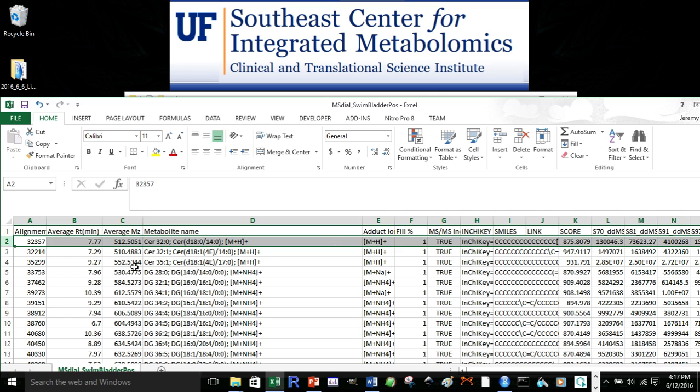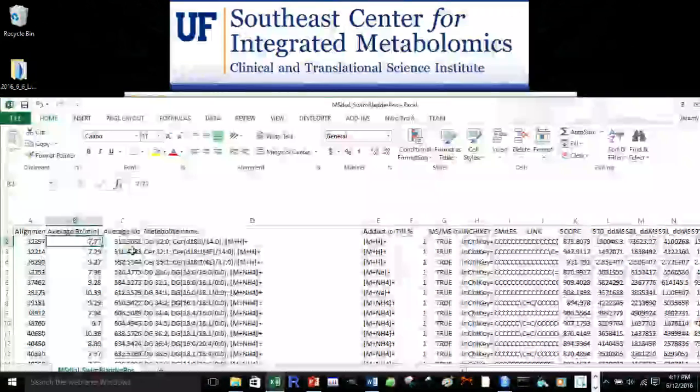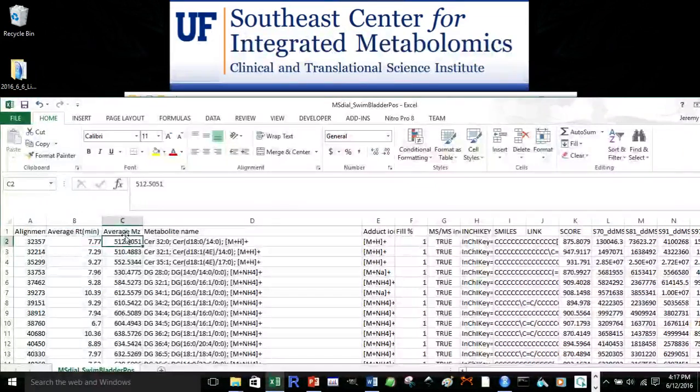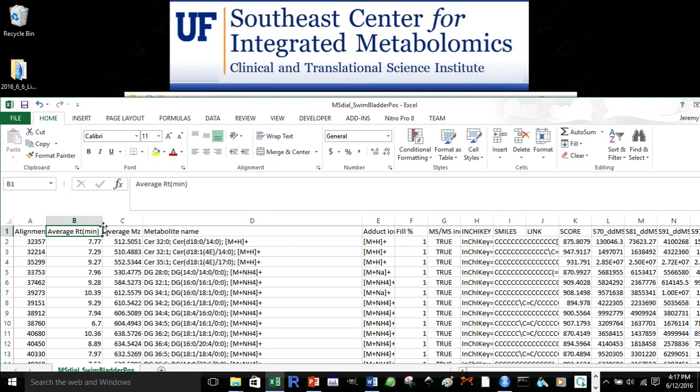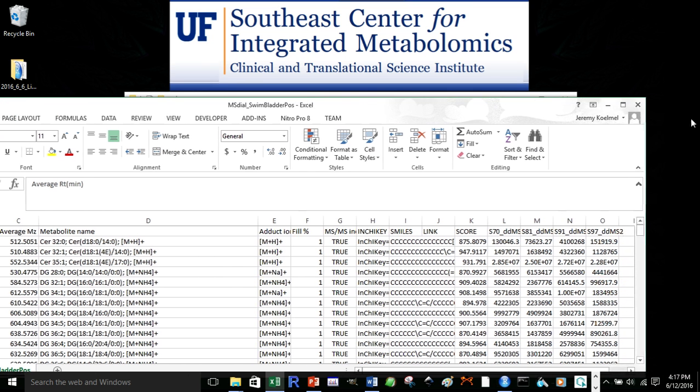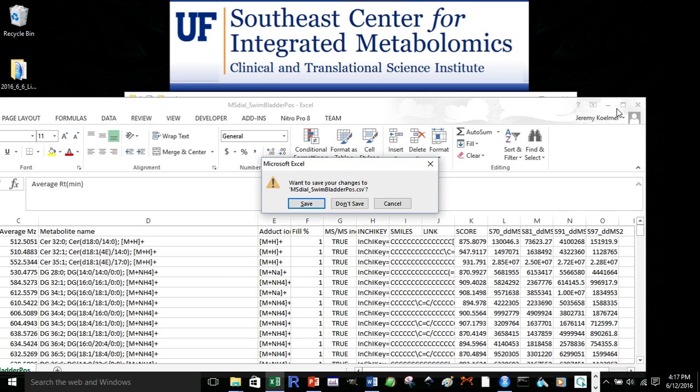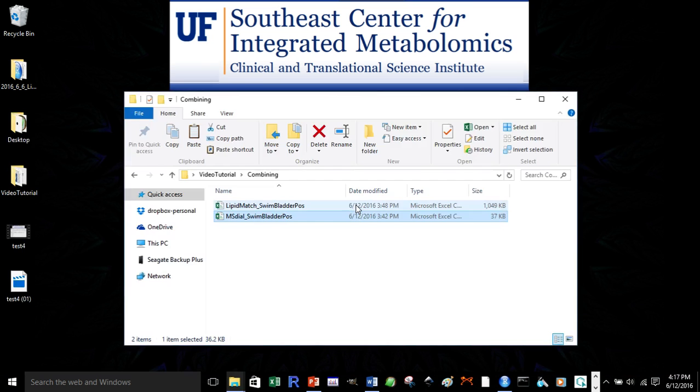The row the data starts in is the one you see the first numbers for the mass of charge and retention time, and the data file should only have numbers for the retention time and mass to charge until the end of the data sheet. So, we'll close this file.